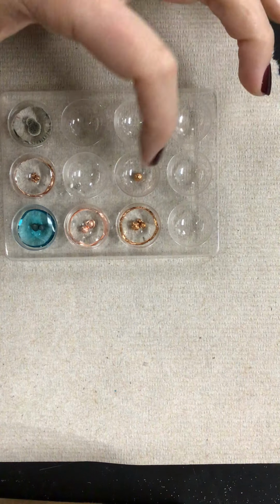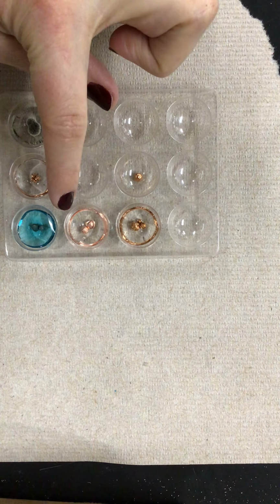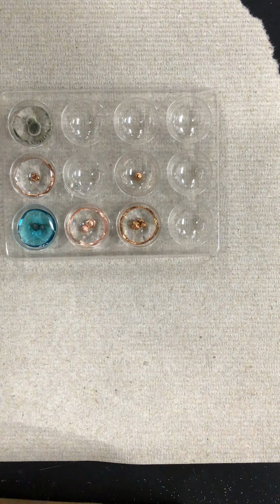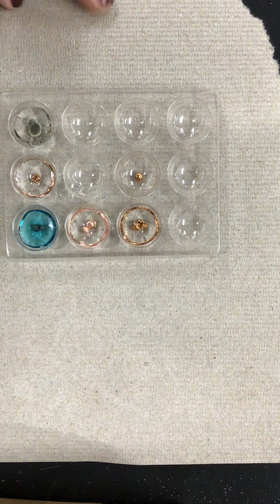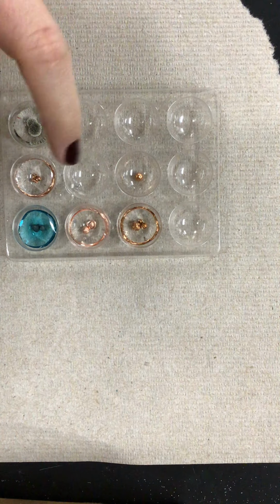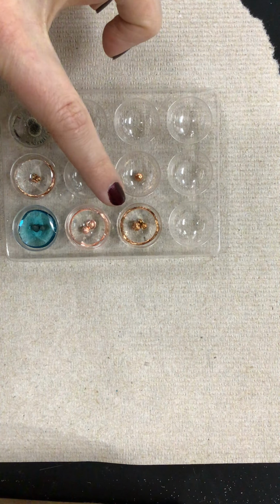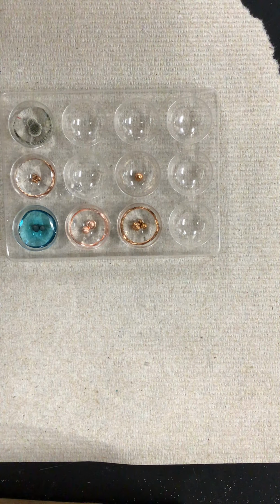With the hydrochloric acid, if we compare the before and the after, I would say that might be an unexpected color change because it's actually getting lighter, like something is almost eating away at the metal. So there was a reaction with the hydrochloric acid. And then it looks like there was not a reaction with the potassium chloride. It looks exactly the same before and after, okay?